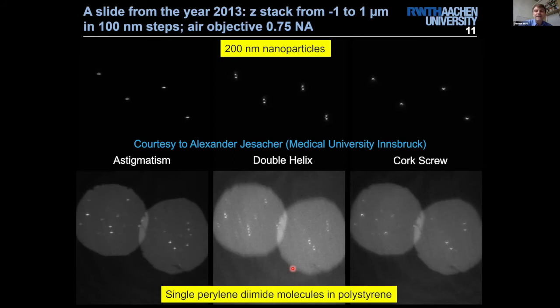And secondly, with these classical reflective spatial light modulators, we always had to give away 50% of our light due to polarization reasons. Therefore, we were very happy when Double Helix came up with these phase masks, which are transmissive and where we don't lose this 50%. And to have twice as much light, believe me, with single molecules makes a nice difference.